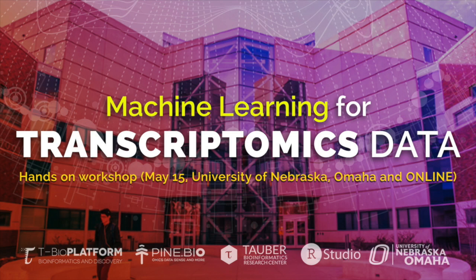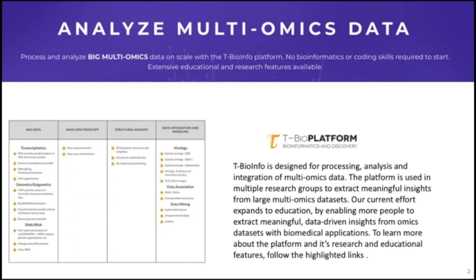Machine learning for transcriptomic data, from raw reads to data exploration, machine learning, and visualization. This is a preview of a workshop that we did at University of Nebraska in Omaha on May 15th. The T-Bioinfo platform was designed specifically for research use, but we're using it for education. We're building a full curriculum around the platform.